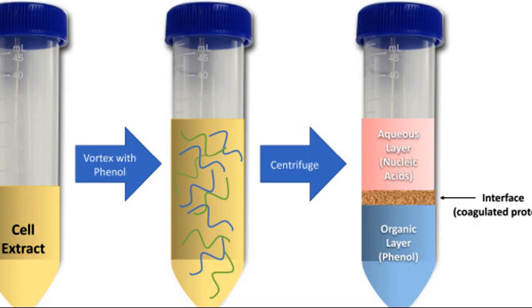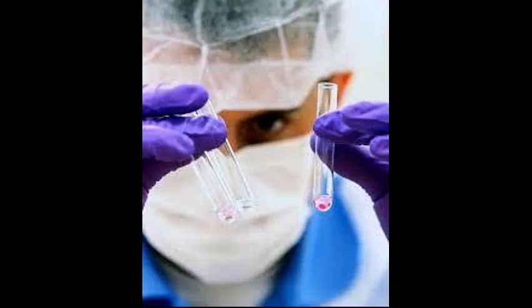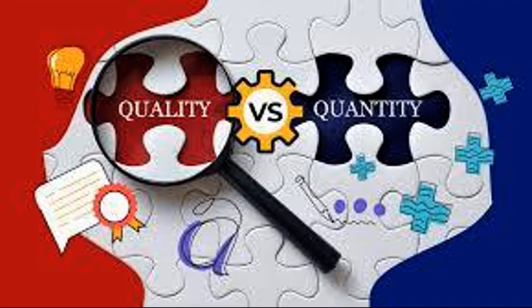This, again, is achieved by using chemicals or enzymes to remove the proteins from the sample. After that, the sample is then purified of other components. Purification can be reached by using methods such as phenol-chloroform extraction, which separates nucleic acids, or just DNA, from other molecules. Once that occurs, the DNA is assessed to determine whether the quantity and quality of the DNA is good enough. After that, the next step is quantitation.